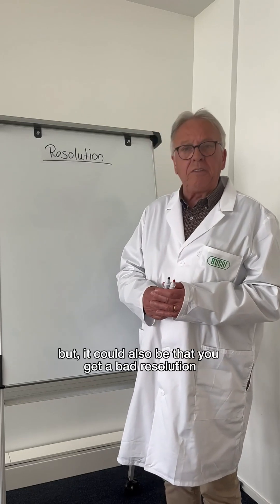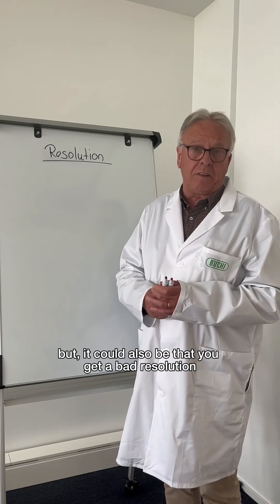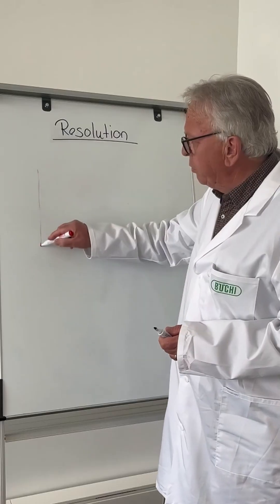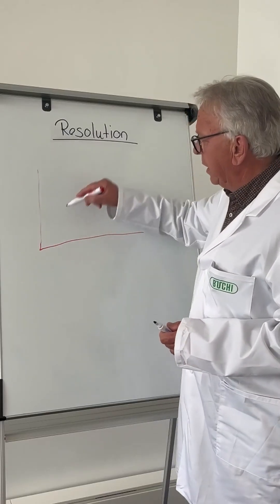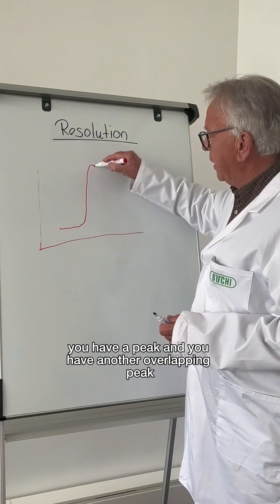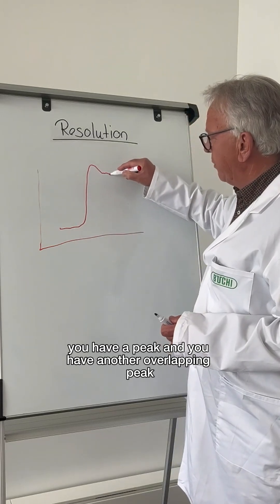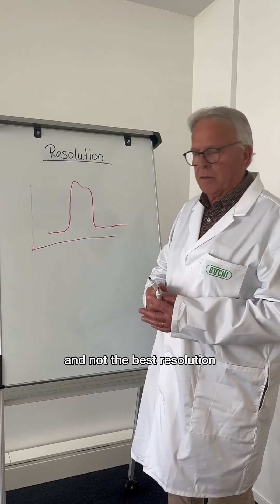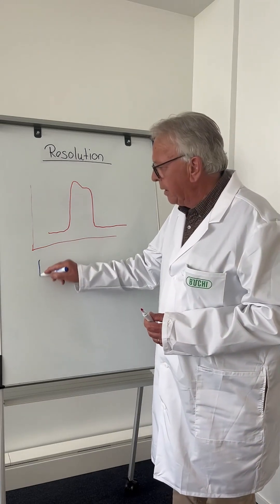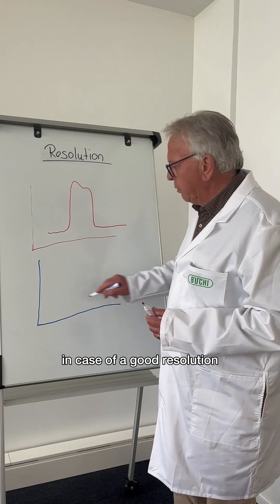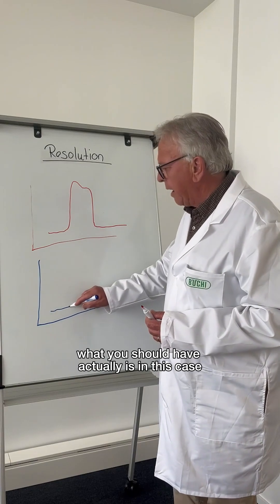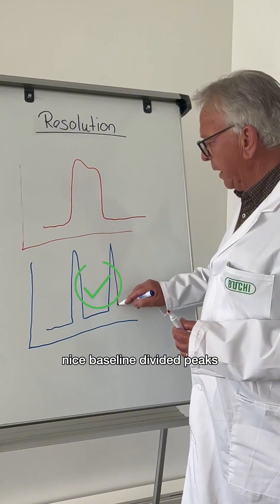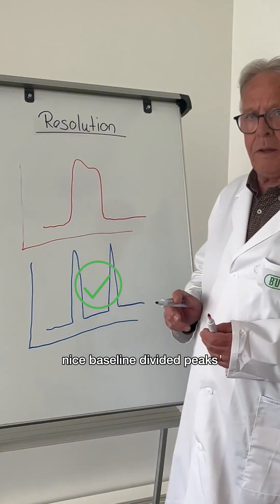But it could also be that you get a bad resolution. A bad resolution could look a little bit like this — you have a peak and you have another overlapping peak. This is not the right separation and not the best resolution. In case of a good resolution, what you should have is nice baseline divided peaks.